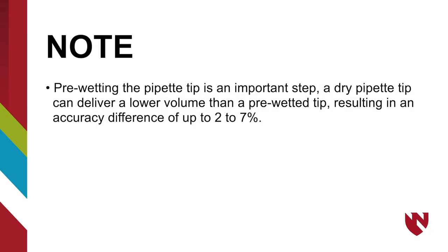Continue by pre-wetting the pipette tip. This is an important step. A dry pipette tip can deliver a lower volume than a pre-wetted tip resulting in an accuracy difference of up to 2 to 7 percent.